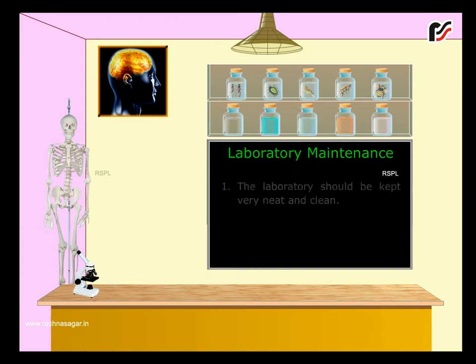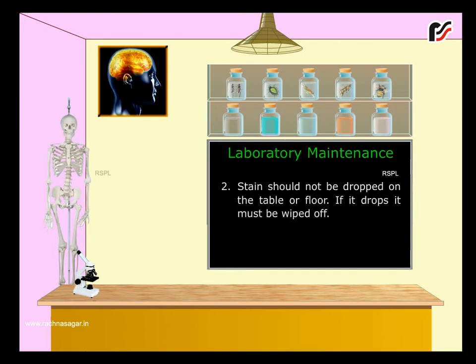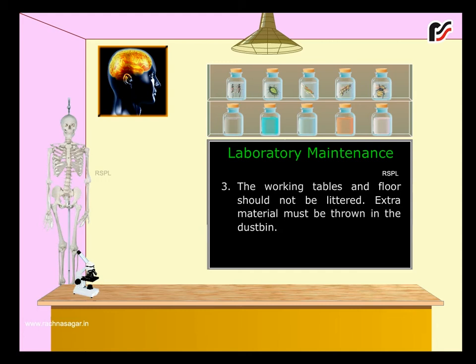Laboratory maintenance. The laboratory should be kept very neat and clean. Stain should not be dropped on the table or floor. If it drops, it must be wiped off. The working tables and floor should not be littered. Extra material must be thrown in the dustbin.